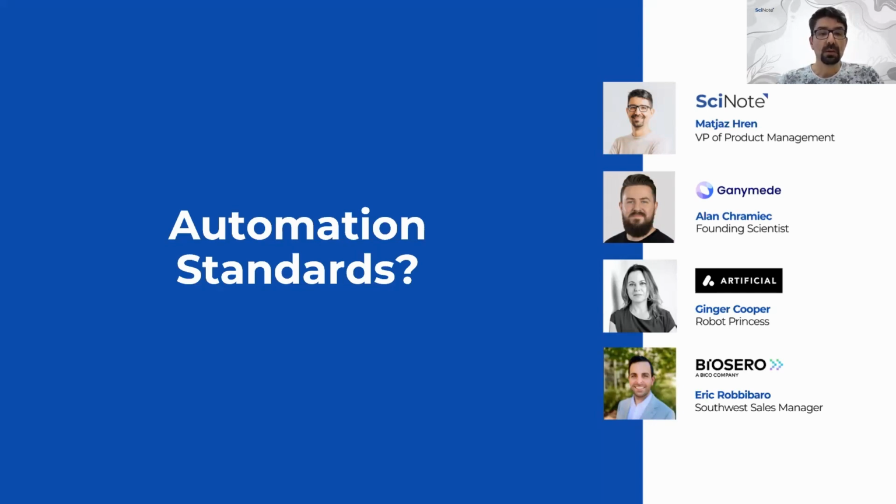For example, those standards, I can mention a few, were the Allotrope Foundation's ADF, the Allotrope Data Format, AnIML, an XML-based analytical data storage and data exchange standard, and then the Pistoia Alliance, which is promoting their Unified Data Model.